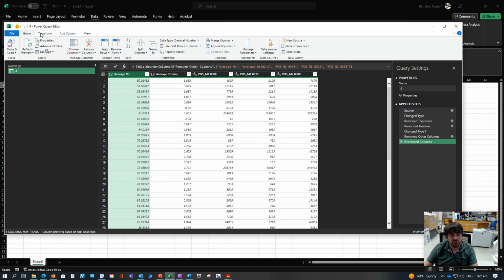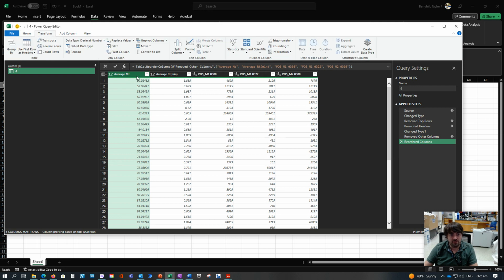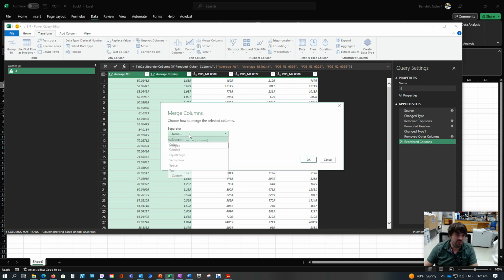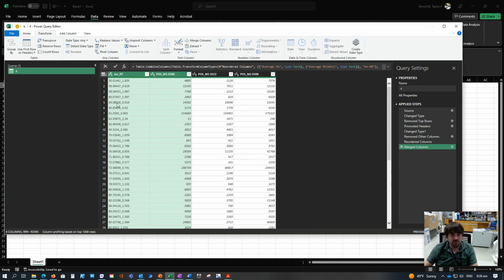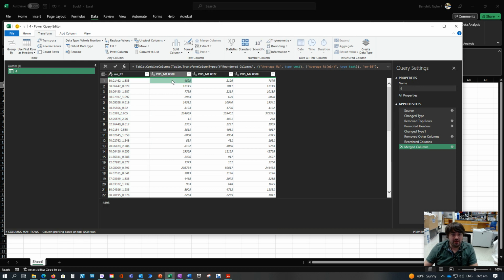We're going to go to this transform tab up here, hit control on each header. You go to merge columns. It asks you what separator you want. You can use one of these, or I'm just going to use a custom underscore. You can tell it what you want. We can say MZRT to label the column. You can manually do that if you want by clicking on it, but it's just easier to do it there. And we have our concatenated columns. And now we have our 3 sample columns with area data for each ion feature.